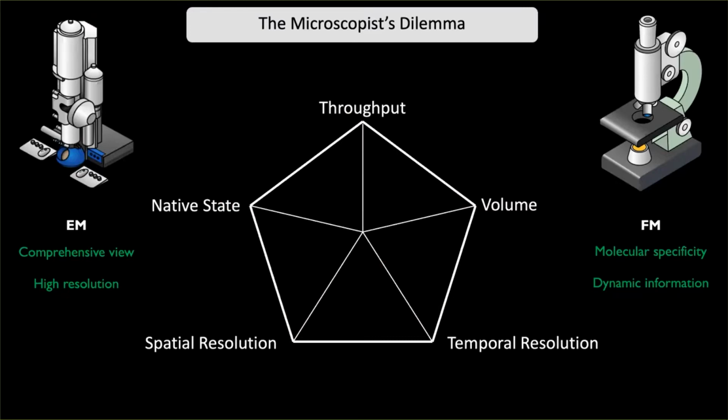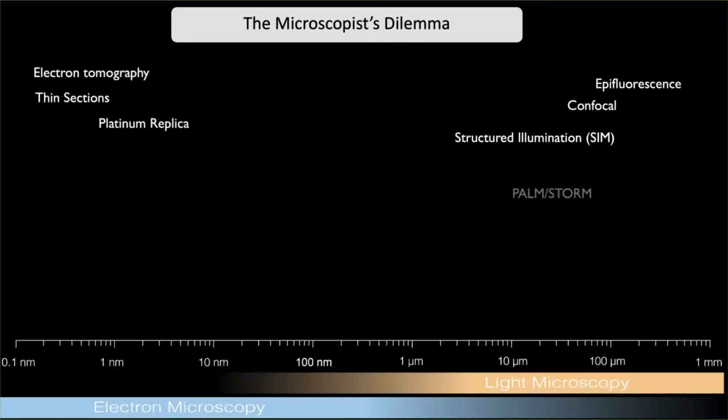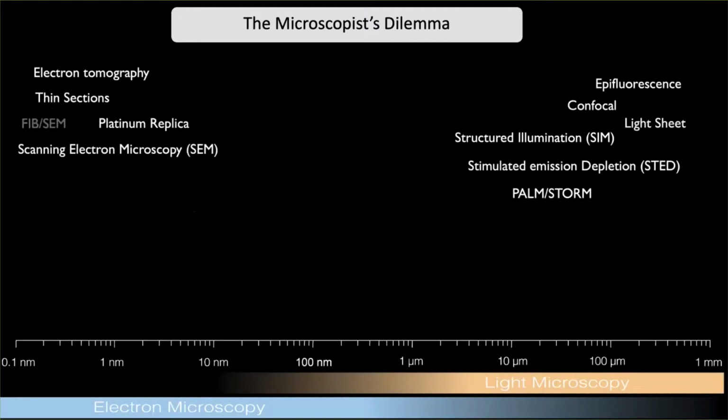So assuming that at this point you agree and you have a fantastic question to ask that using correlative microscopy would be ideal to address, you normally come upon a big challenge or issue, and that is that there are many different imaging modalities in both of these paradigms.